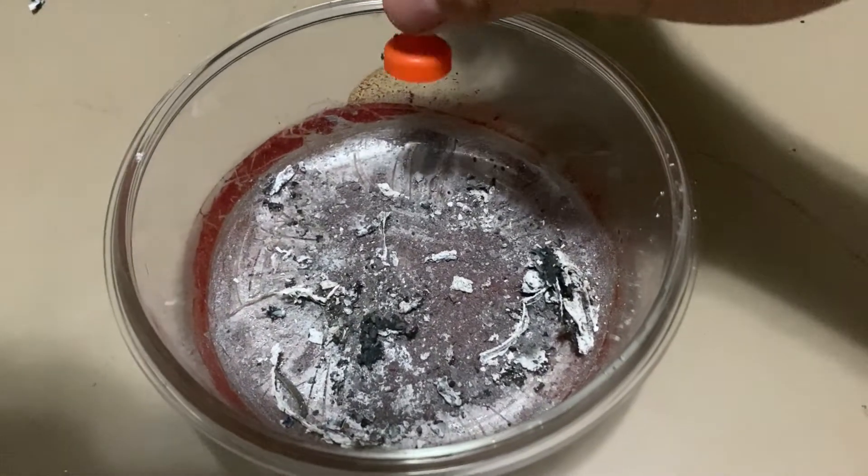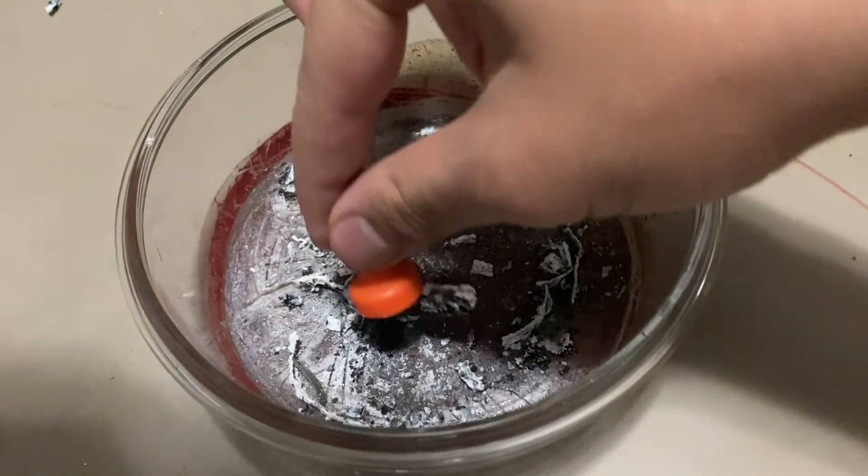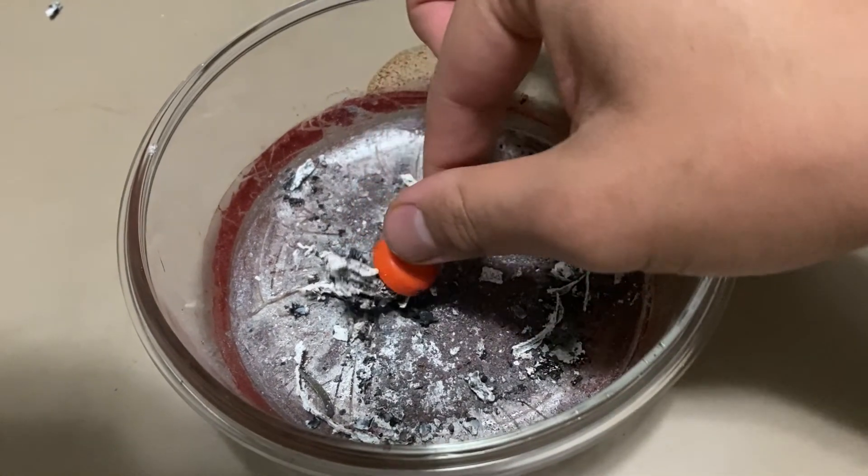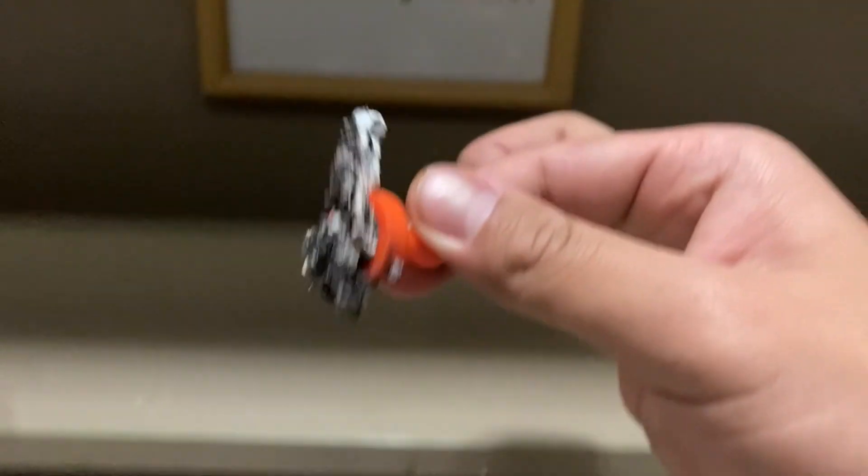Now, to show that we actually made iron from vitamin pills, all we need to do is to place a piece of magnet in the mixture, and a black solid will be attracted to it.